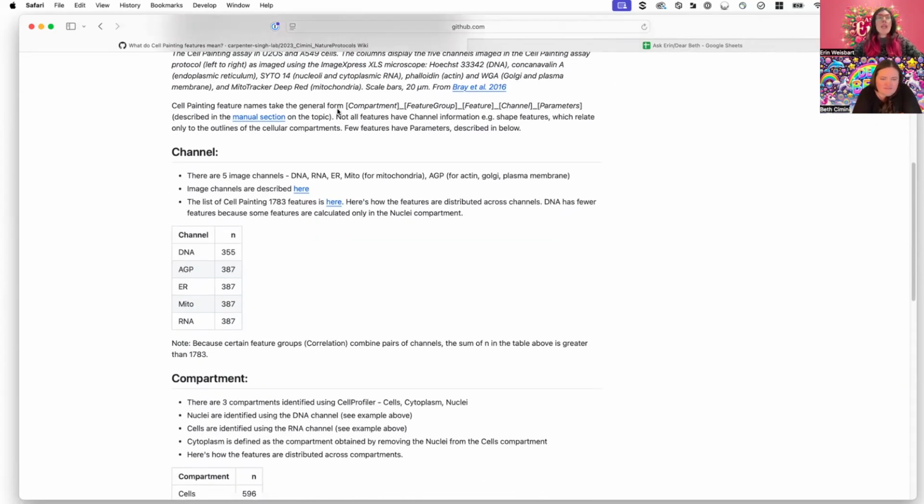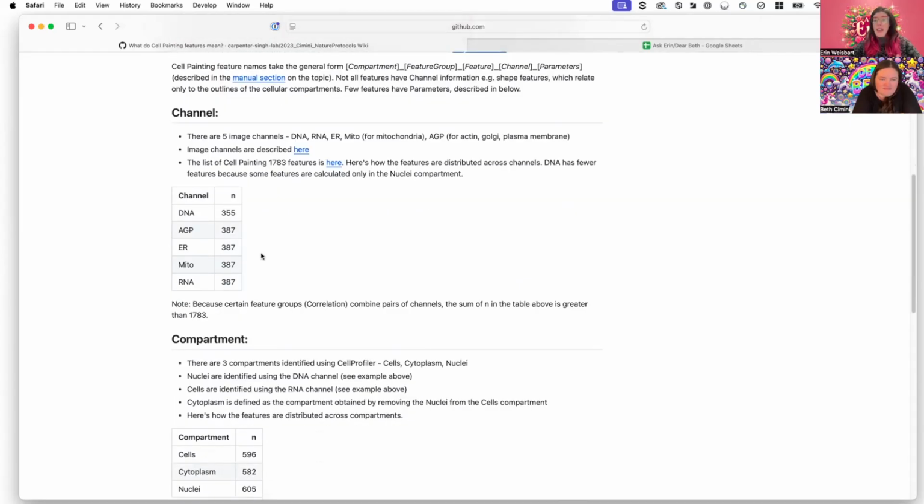So then, many measurements, thousands of measurements. This is an older version because back then we were only doing like 2,000 features, and now we tend to do closer to like 8,000. It's kind of nuts, all the things. I like it.